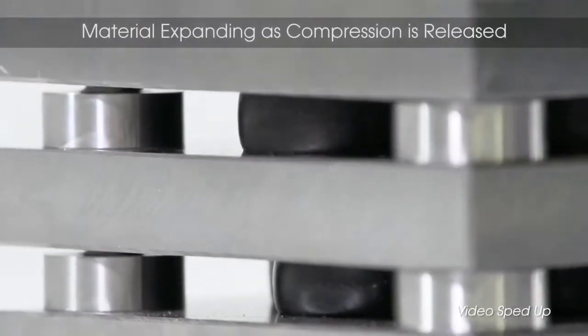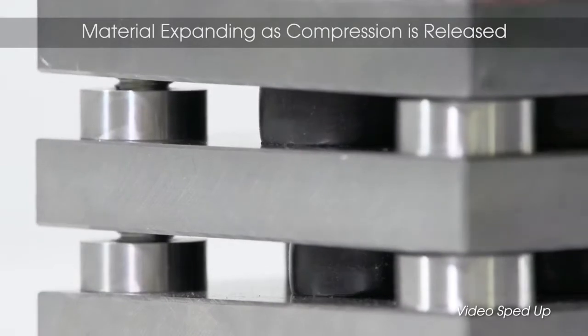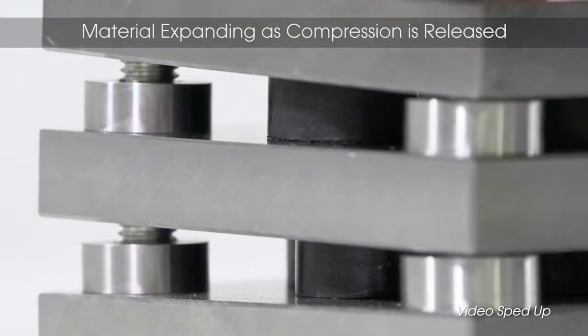Results from testing show the material's loss of resiliency or its ability to return to its original thickness after prolonged compression. This is also known as the material's memory or permanent set.